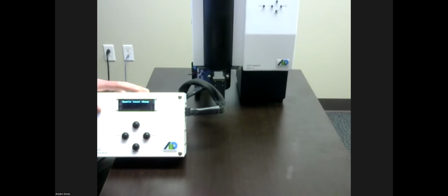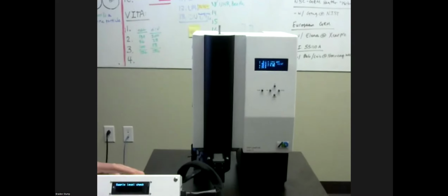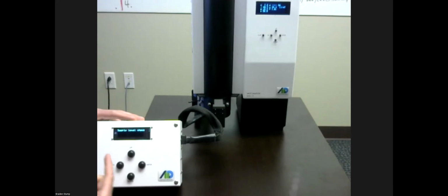So sample level check is occurring. You can see the air pump to the sampler has now turned on and then off again to just kind of dose a little bit of water into the liquid vial. And it has now started to begin. So you'll see this change in just a moment. You're going to see sampling on, remaining time 15:59, and then you're going to see moderator temp 18C, sample temp 10C, and you're going to see that timer start to count down.